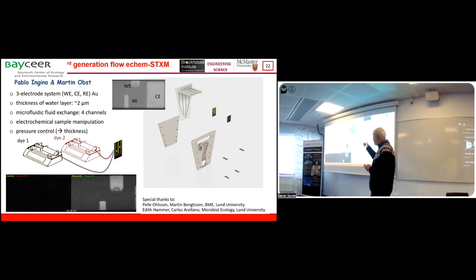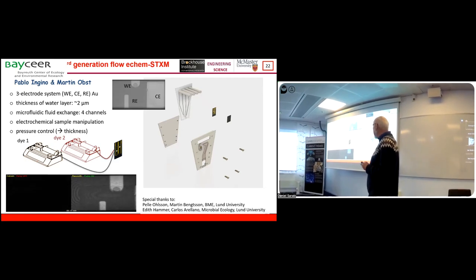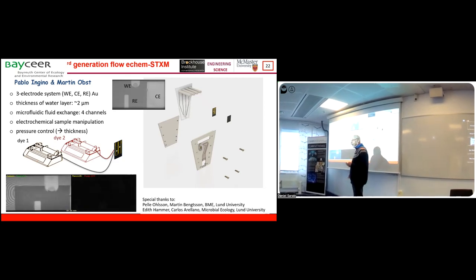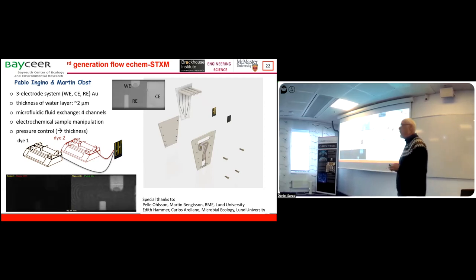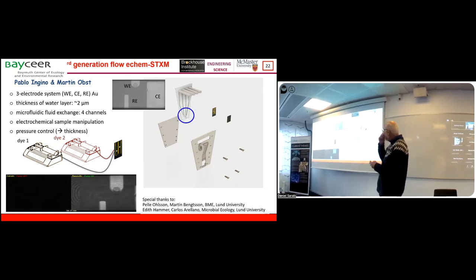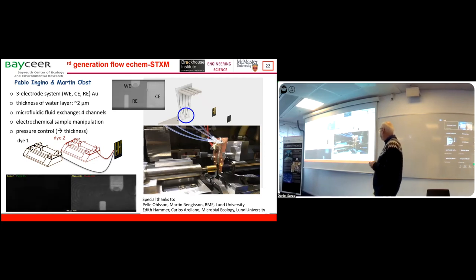And by switching one syringe pump to pump one dye through versus the other dye, you can watch the imaging at the two different energies where the dye is emitting change from one to the other. And it takes place, in this particular example, in maybe 2 or 3 minutes. More typically, it takes 10 to 20 minutes. Okay, so we use that to advantage. Again, get a little better picture of the device.